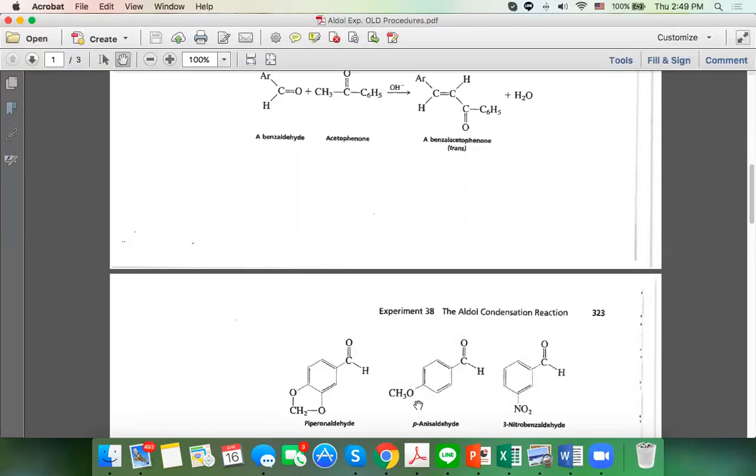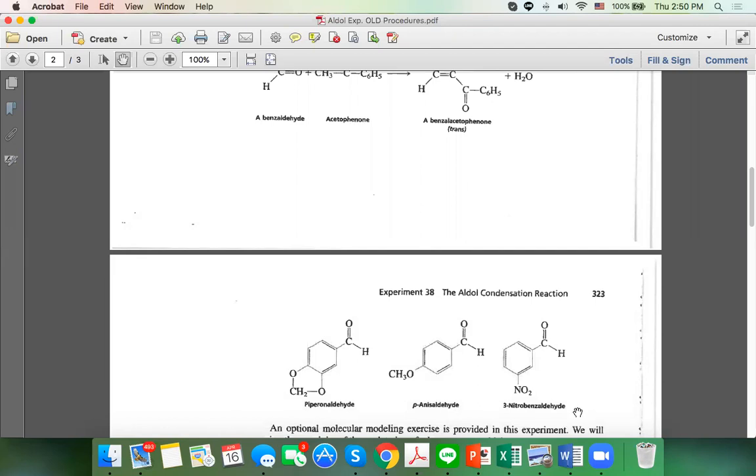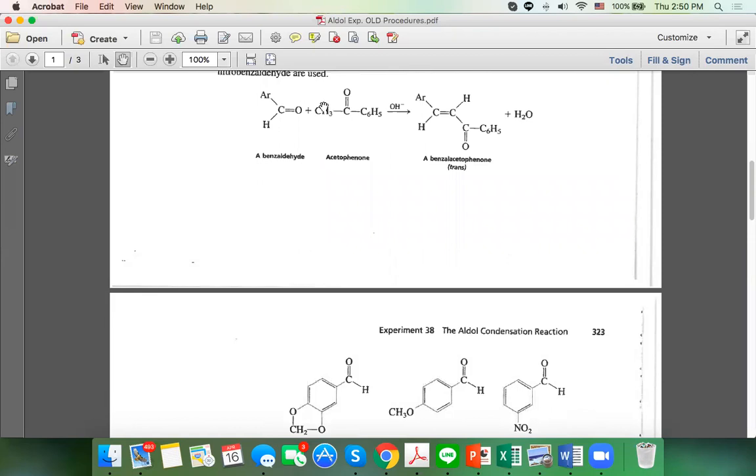And that cinnamaldehyde also smells like cinnamon. No joke, it is the active ingredient of cinnamon. So when students run that reaction, they smell the cinnamon at the same time, okay? All right, go look up the cinnamaldehyde, okay? And I want you to see, in the old days, we asked students to run the reaction using only one side, one alpha hydrogen, okay? One side of alpha hydrogen.